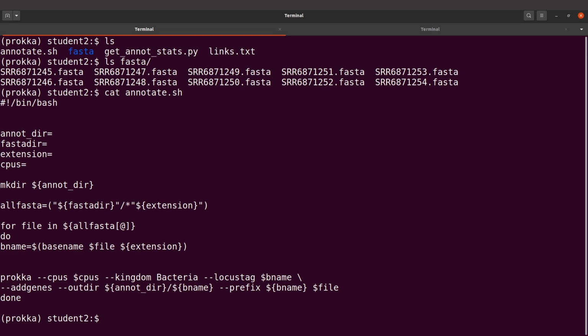Okay, so I'll do this. Let me just clear the screen. Oh, by the way, before I clear the screen, I'd like to say that if you want further explanation of how the script works, I'll be happy to provide it. In case you run the command and want more information about how the script works, just let me know and I'll give you a description of it.